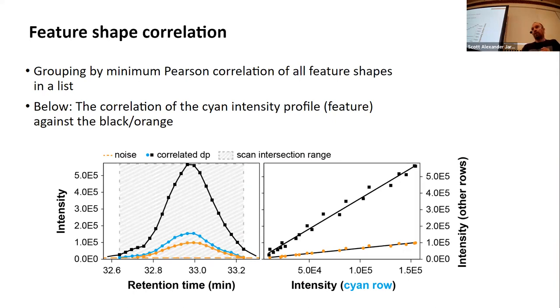All right. Then we did not only use this MS1 data to get this quant information, but also to look at different adducts. This is buried in one of the modules in MZmine, ion identity networking, where we look at co-eluting features that have given mass differences.